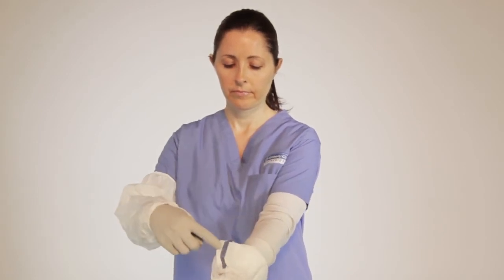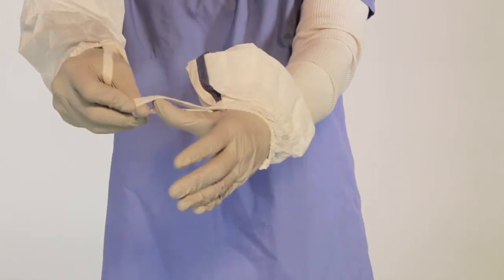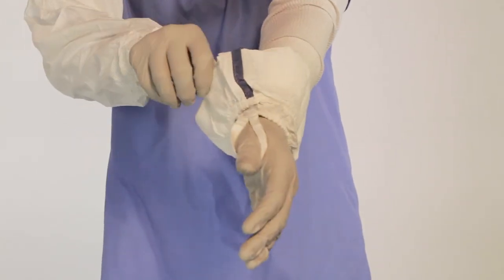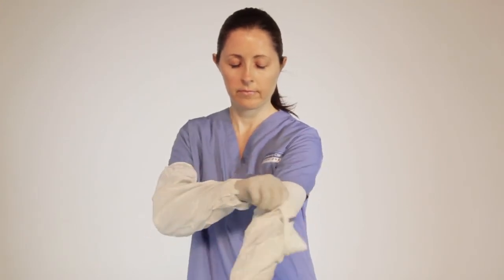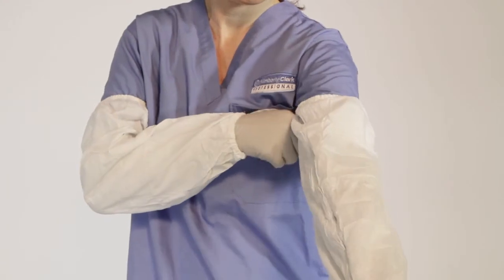Locate the blue line again. Position the opening to align the thumb loop to the thumb. Place the thumb loop over the thumb. Touching the side with the blue line, pull the sleeve up the arm to the bicep to complete the donning process.